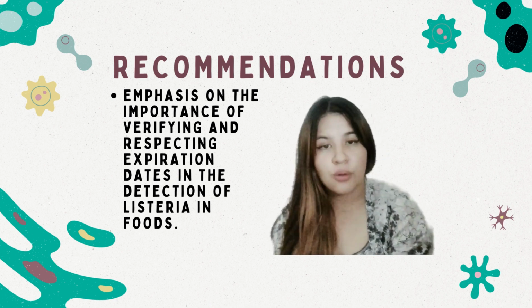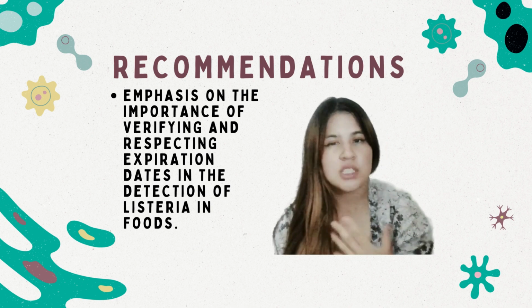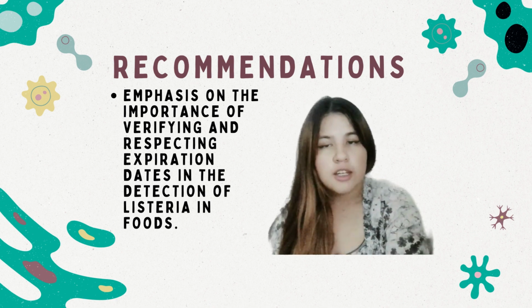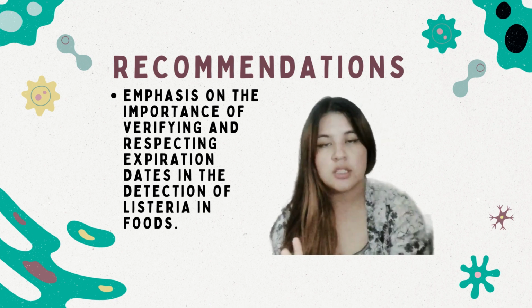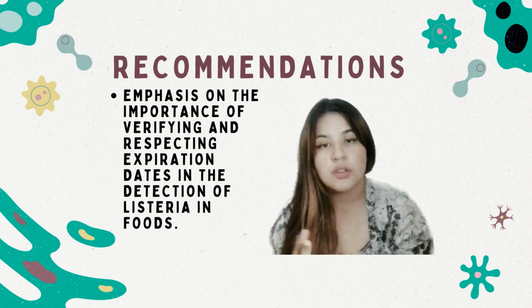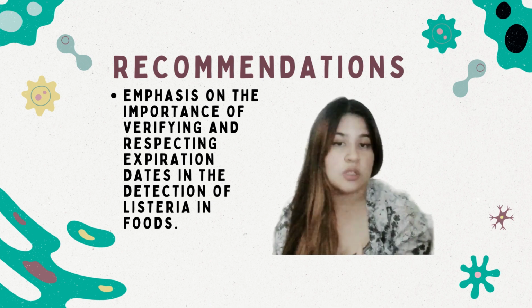And although the use of expired tests was carried out for the purpose of a practical simulation to learn about the process of detection of Listeria in food, it's essential that the students, in addition to acquiring laboratory knowledge, understand the relevance of food safety and the use of effective and appropriate tests in real situations.